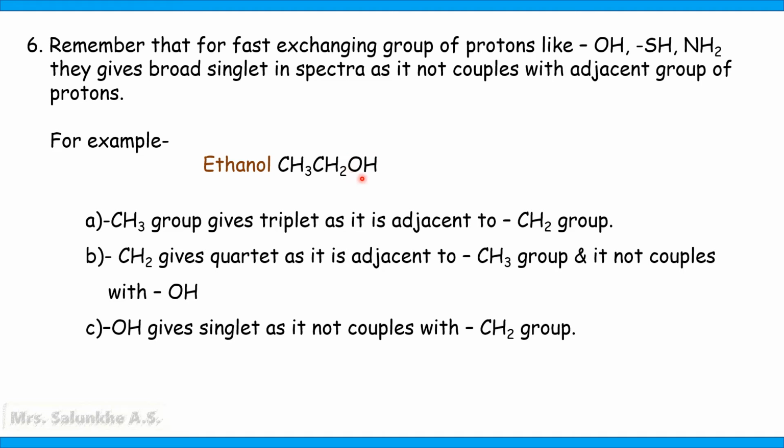Therefore, groups like OH, SH, NH2, etc. do not couple with adjacent group protons, and they always give a broad signal in the spectra.